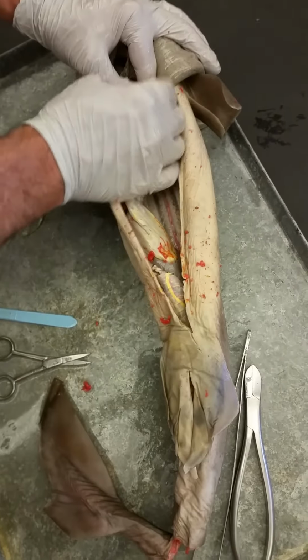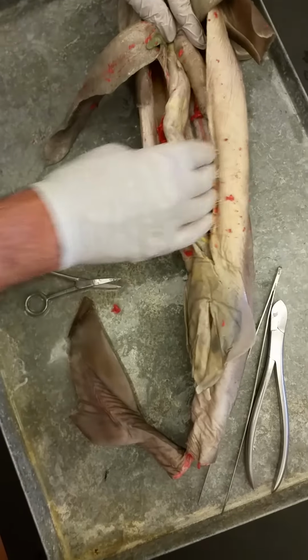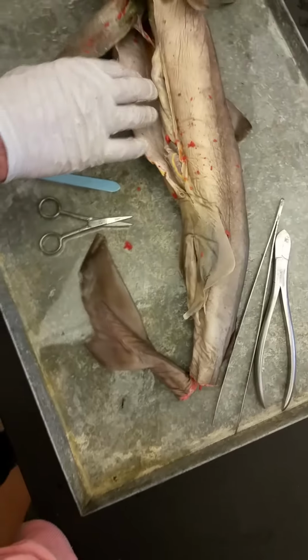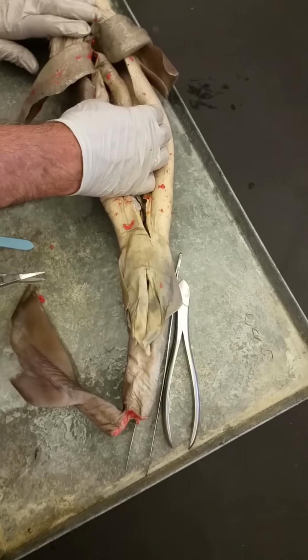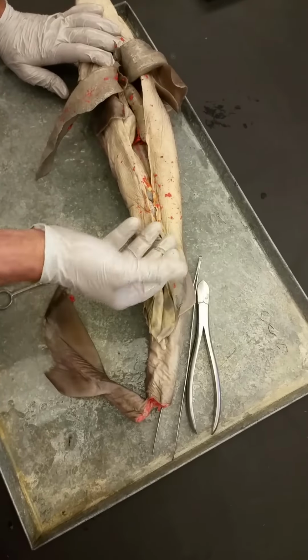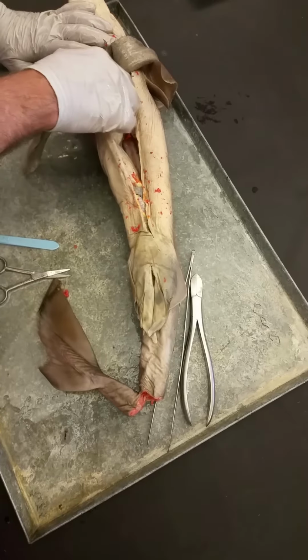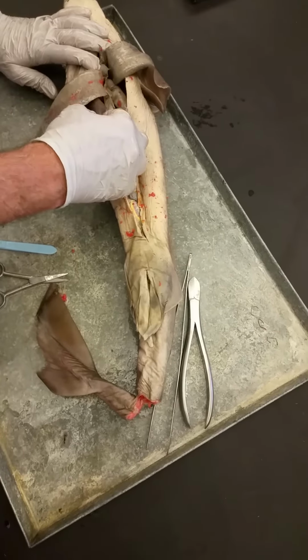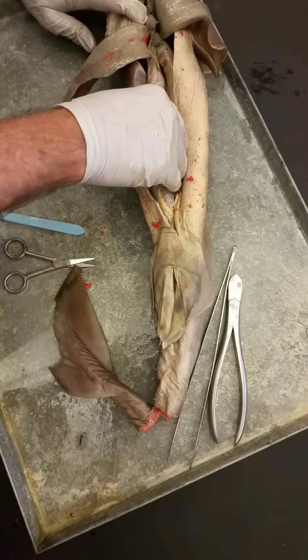Again, a female would be just full of these big eggs, and pretty big in sharks. Another difference in females, which again we don't have one here to show you, is that most of them have live birth, which means they have a uterus. From the ovary, the eggs are released, go through the shell gland, where sperm from copulation is stored, and are fertilized. You then lay down a membrane around them, and then they would develop.